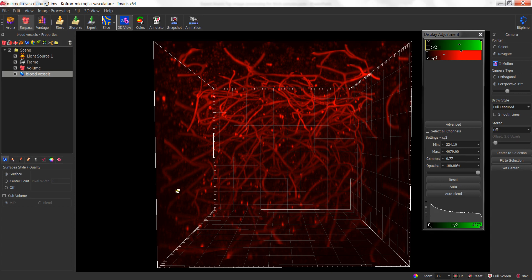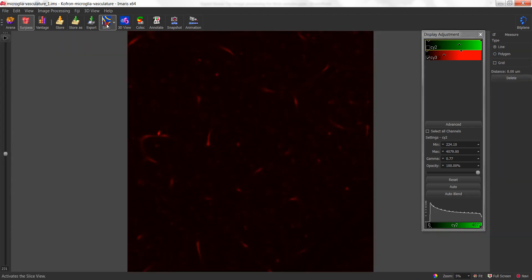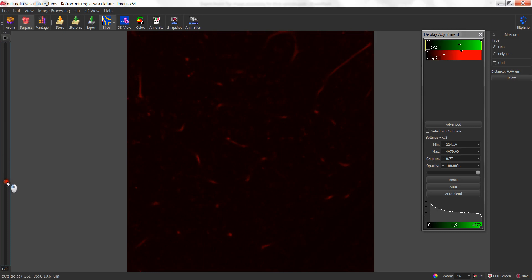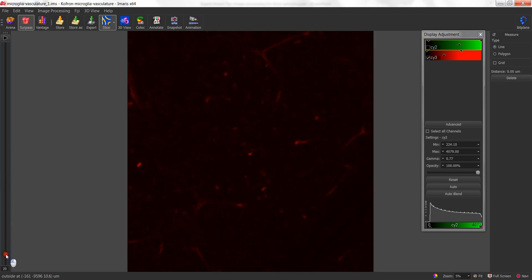The easiest way to do that in Amaris is to use the slice view, which allows you to visualize the individual slices that make up your 3D volume. If I drag the slider bar down, you'll notice that I can move to the bottom of the stack and get an idea of intensity value in that location.